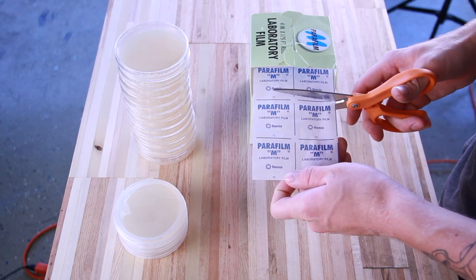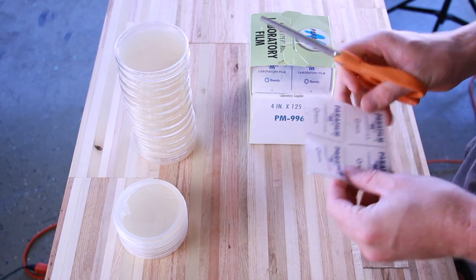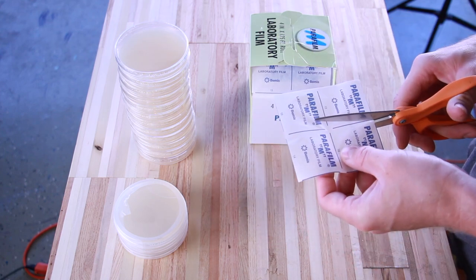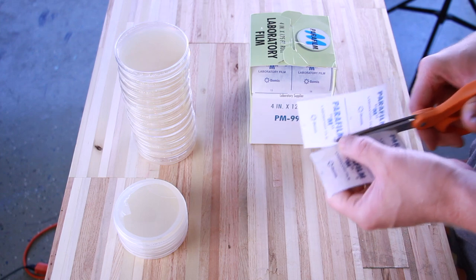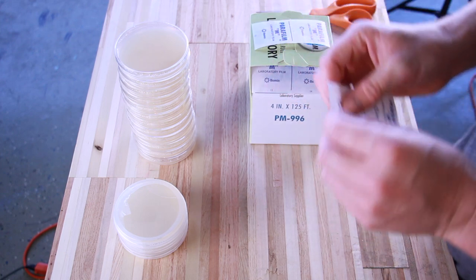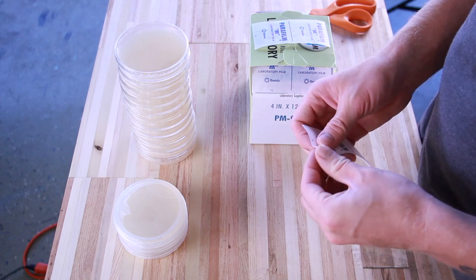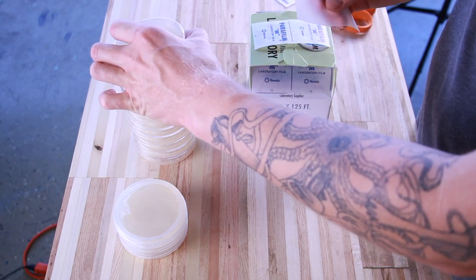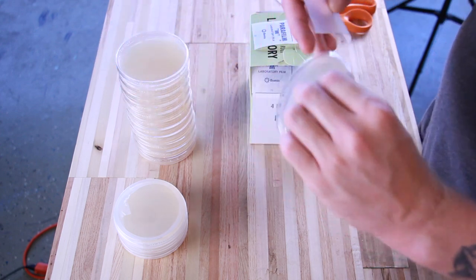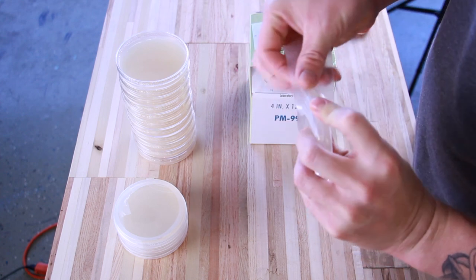Parafilm is pretty cool. This is my first time using parafilm. I really appreciate that they printed squares on the packaging because it makes it easy to cut the perfect amount. I'm using 2 squares long by 1 square wide. And you pretty much just have to stretch the parafilm around the edge of the petri dish, and it seals it really well.